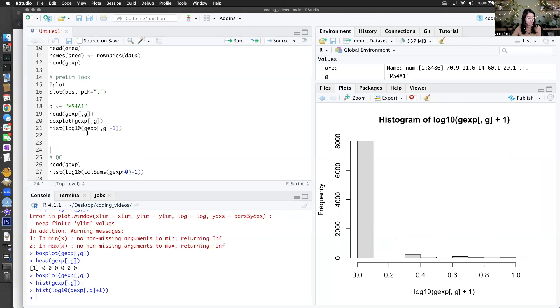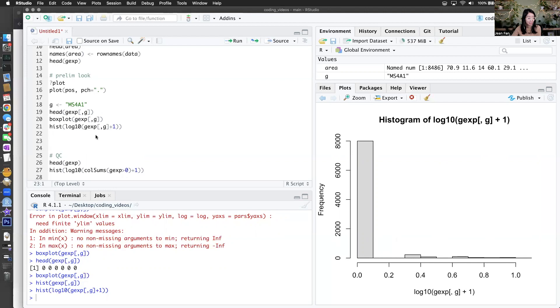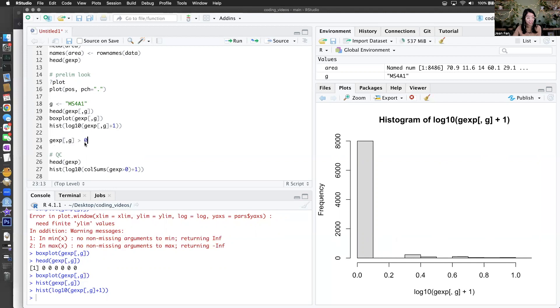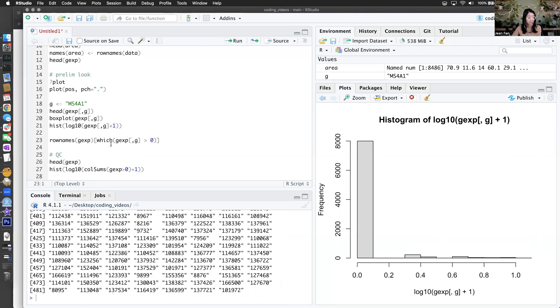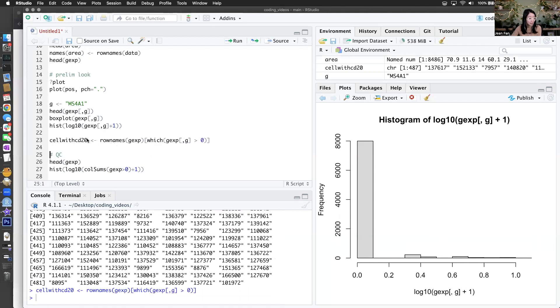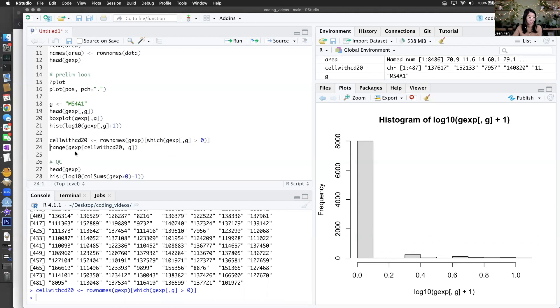I wonder where these cells are in space. Let's say the gene expression for MS4A1 is greater than zero — which cells? These are the indices. So if I do row names, these are the cells that express this gene, or have detected CD20. Just to double check, I want to see the range of the cells that have CD20 — indeed it ranges from zero to 11.